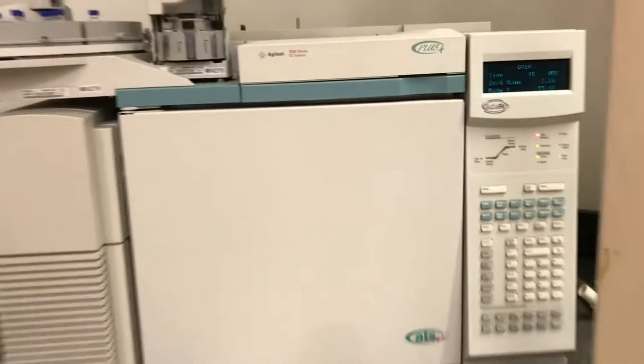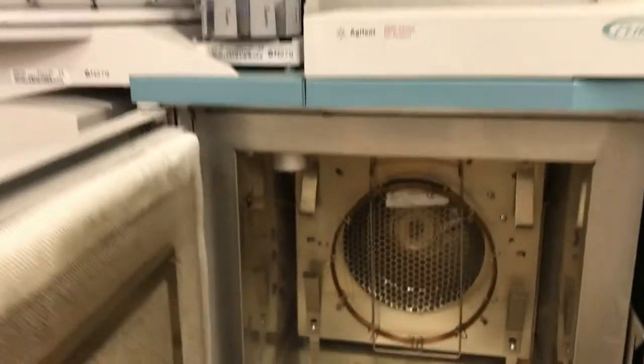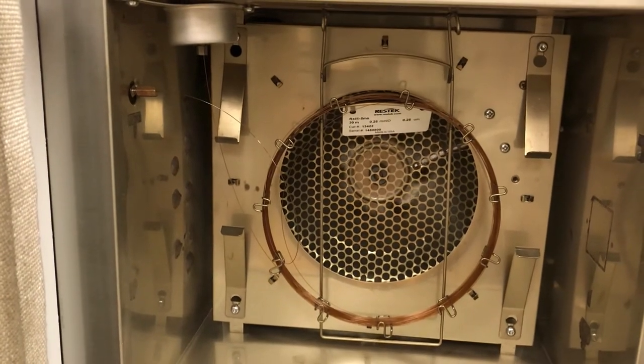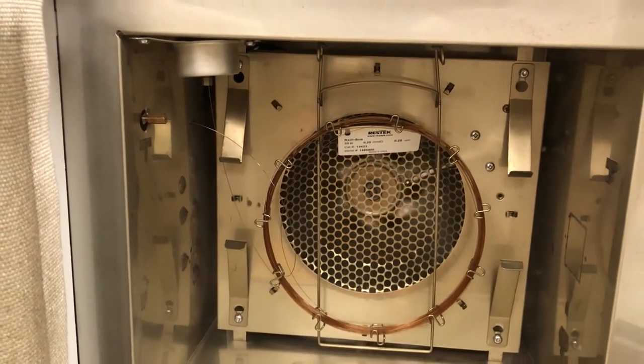So here is our GC instrument and I first want to show you the inside. That coil that looks like a copper wire, very thin coil wrapped up, that's the GC column. That's a hollow tube filled with an absorbent and it's 30 meters long normally.